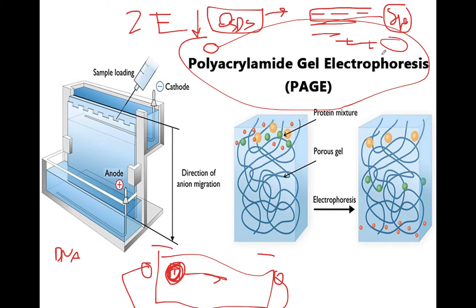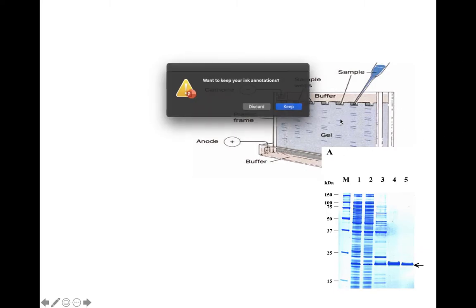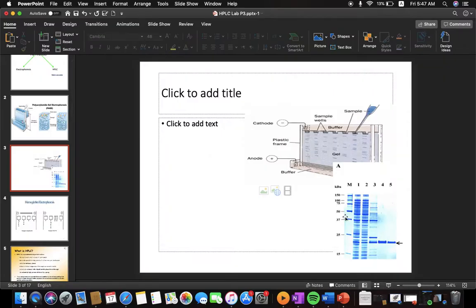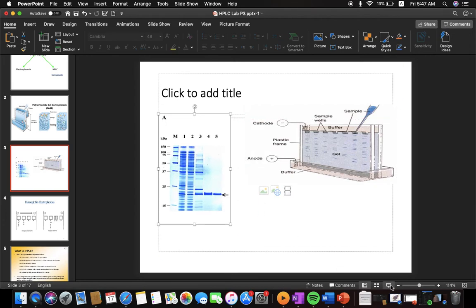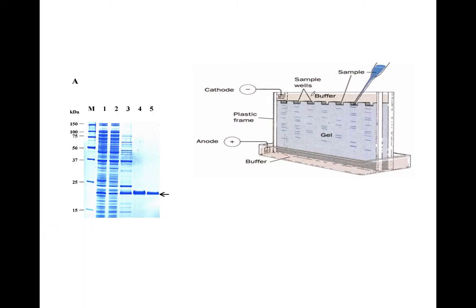Okay, so let's talk a little bit about this one. First of all, this slide shows that we put the gel between two plates, here 1 and 2.